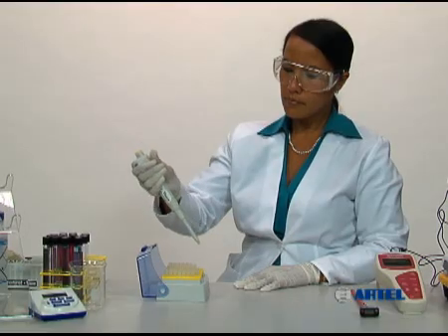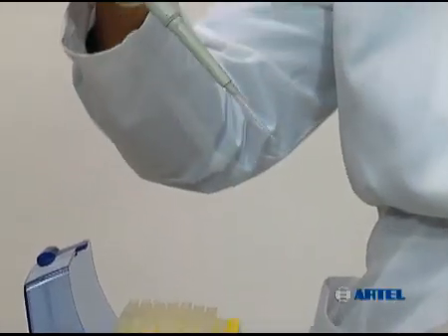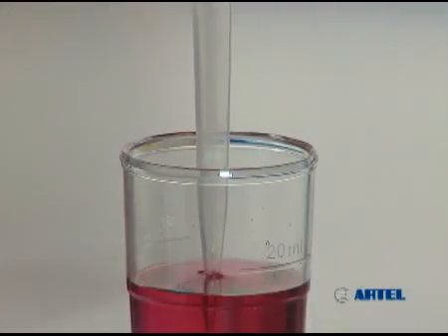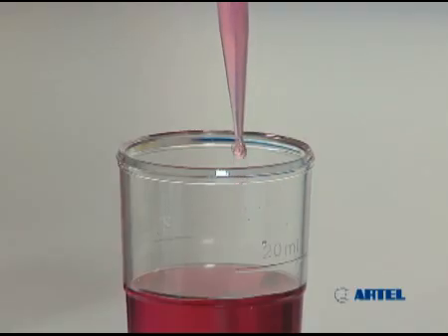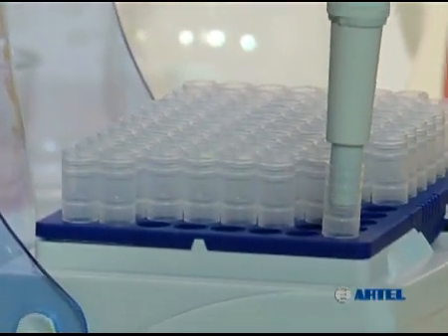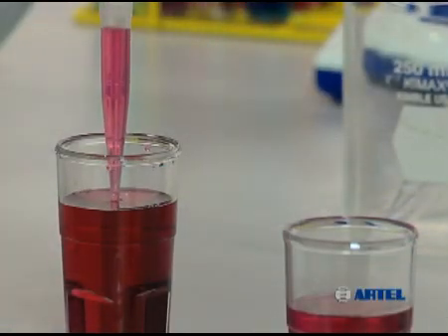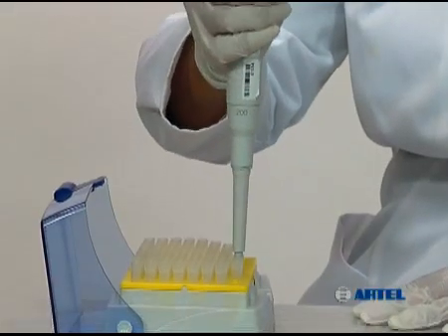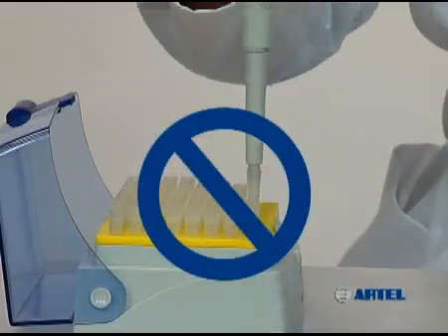In most cases, manufacturer tips are preferred and provide the best seal for more dependable sample delivery. Mismatching a tip and pipet, or using a poor quality tip, can result in inadequate seals between the pipet and the tip. Quality tips are flexible and have thin walls, providing an airtight seal and more dependable sample delivery. When placing a tip on the pipet, do not use excessive force, which can cause damage to the pipet nose cone.